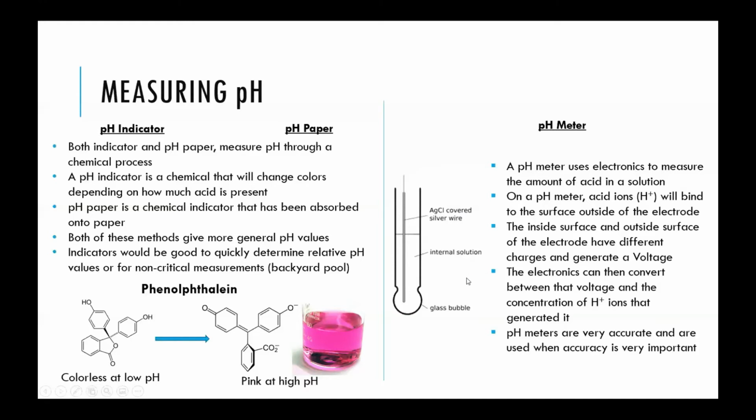What happens is the H+ ions will stick to the glass on the outside, and the H+ ions on the inside are also sticking to the glass, but on the inside. Because acid ions, H+, have a charge, there is some electrochemistry, an electrical signal being generated from this type of setup. You have one charge on the outside, depending on the concentration, and a different charge on the inside.